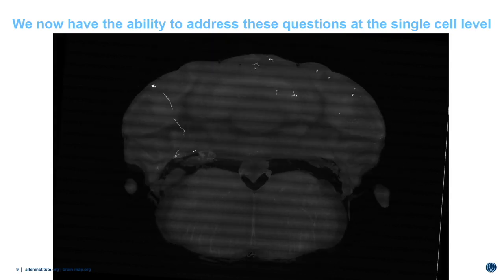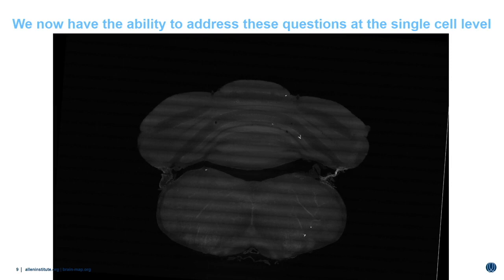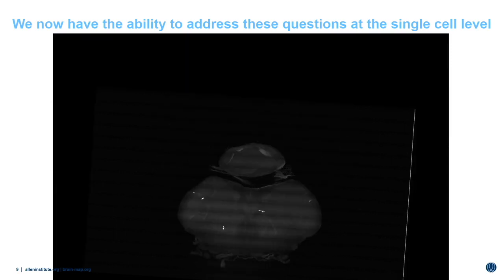Basically, there's about 120 neurons labeled in these TNT1A brains that are crossed to a couple of different transgenic reporter lines, and we can very faithfully get the local morphology and also the long-range projections of these LGN neurons.